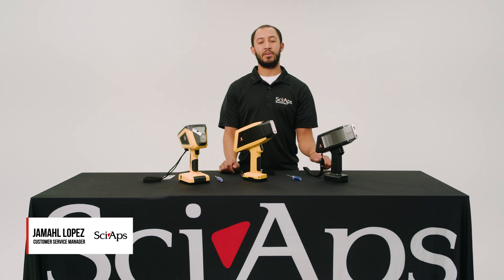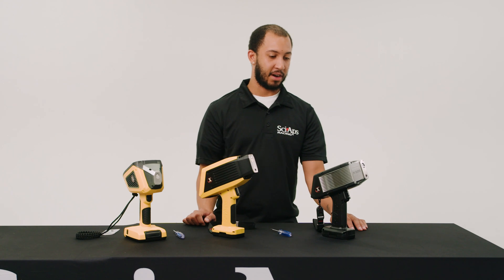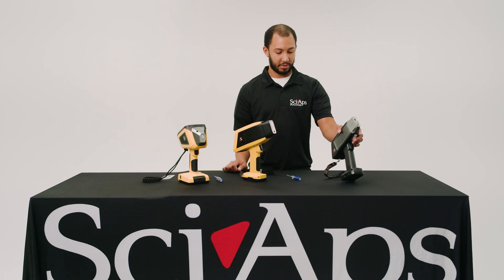Hi, my name is Jamal Lopez. I'm the Customer Service Manager over at SciAps, and today we'll be going over how to change Prolene and Kapton windows on our XRF units. We'll get started on our X-505, and it's the same process for our X5, 550, and 555 units. Let's get right into it.